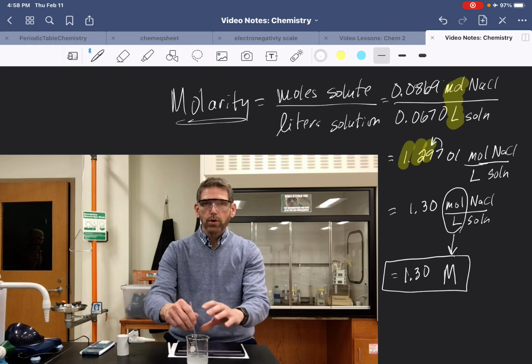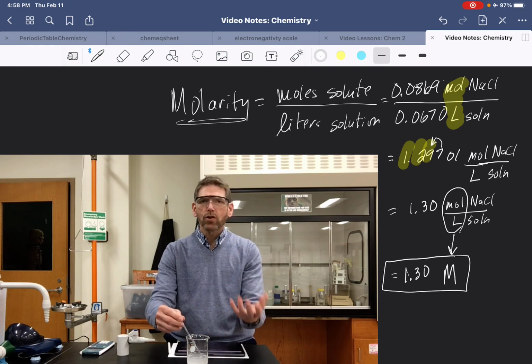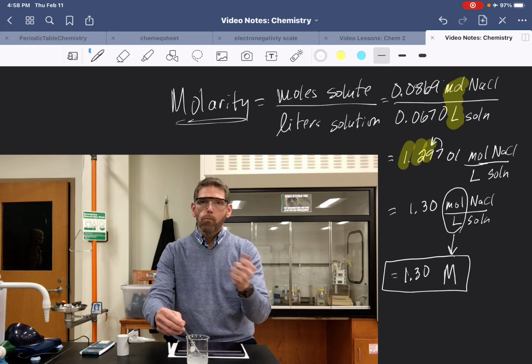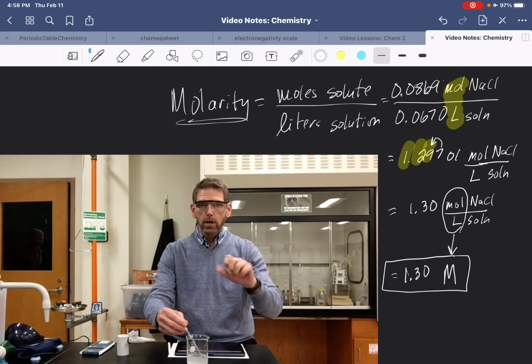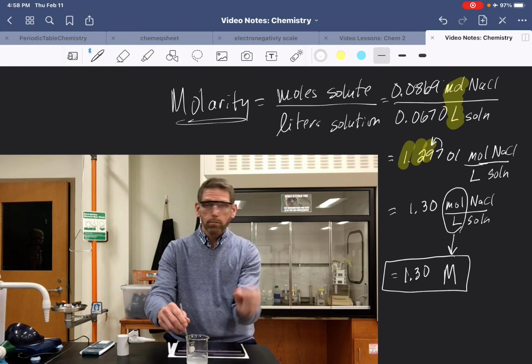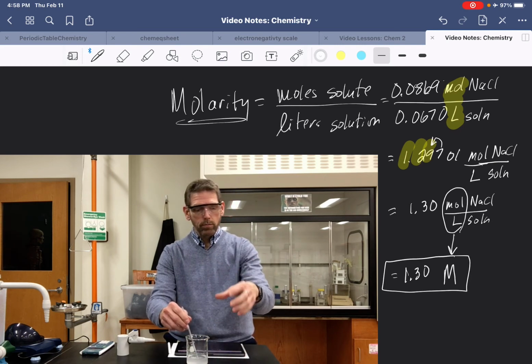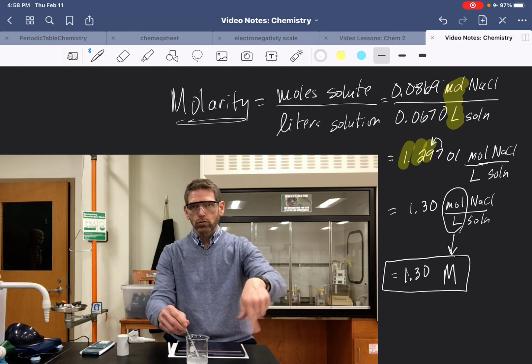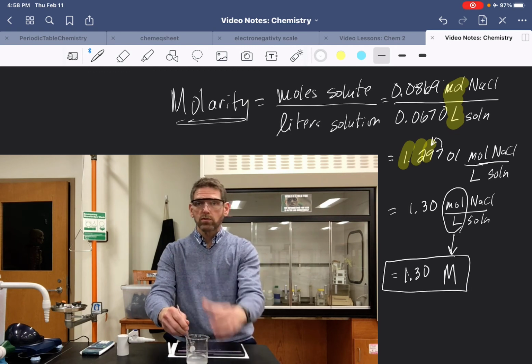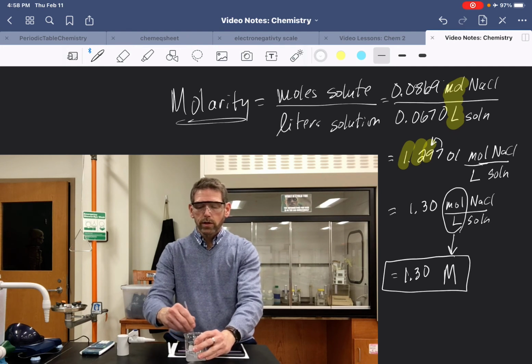And sometimes if you put it into a container, like an Erlenmeyer flask, then you can put a stopper on it, and as long as it's sealed properly, if you use the right type of sealant, then you can wiggle it around just a little bit. Or you could still typically use a stir bar in there. You put it on a little stir plate, and it does the work for you while you're over somewhere else doing other work. Just going to stir this up, and we'll just say that that's all dissolved.